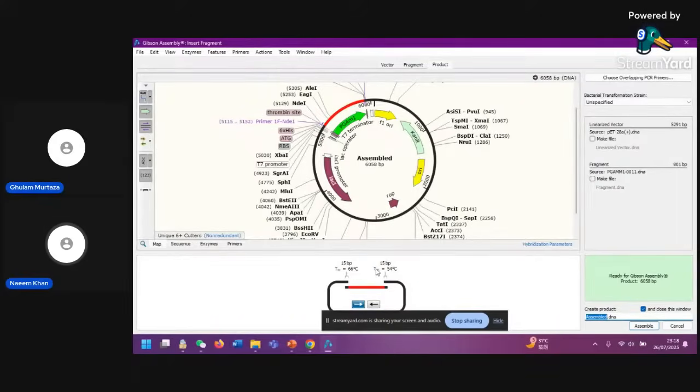We have chosen 15 and 15. Basically we chose one for 19 and the second for 20, but here we can see just 15 and 15 base pairs, because we chose the 5 or 4 which I told you from the left or right side. They are the digestible portion, it doesn't matter. But the 15 which we choose is very important. So we choose 15 for the reverse and 15 for the forward restriction site. Now you can see our fragment is ready.